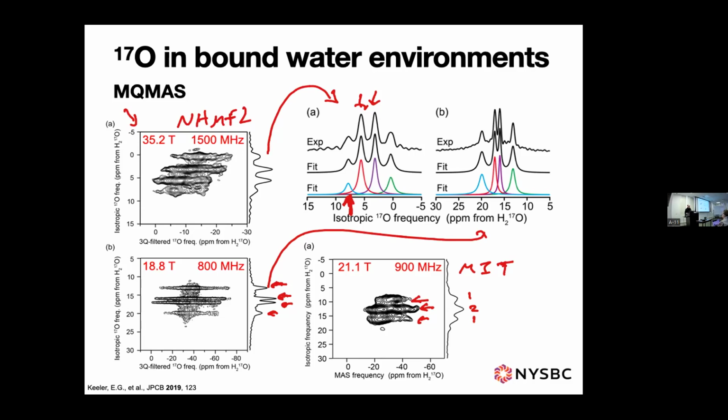But in this instance, you can look at them and say they're probably going to be pretty similar, so they should have a triple quantum excitation and conversion that is similar in magnitude. So it's not necessarily that I would have fit these and said, oh, we definitely know it's 1 to 1 to 1. It was just more that this was 1 to 2 to 1, so we're saying, well, it's still 4 like we thought, but we're only seeing 3 peaks.